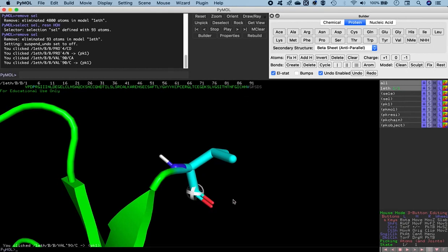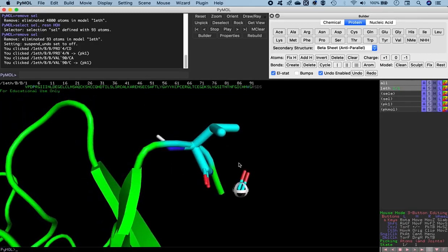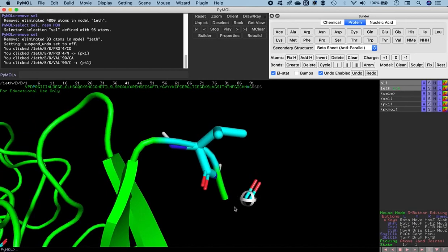So this is the valine residue that we have, and next to that there's this glycine residue, and arginine, serine, aspartic acid, and serine. So we are going to first build the glycine residue. So once we click on glycine, it makes an automatic reconstruction of the glycine residue, and immediately the gray region is changed to green, and it makes a subsequent selection of the carbonyl carbon, or the carboxylic carbon, on the glycine residue now, which will be bonded to the nitrogen of the arginine.